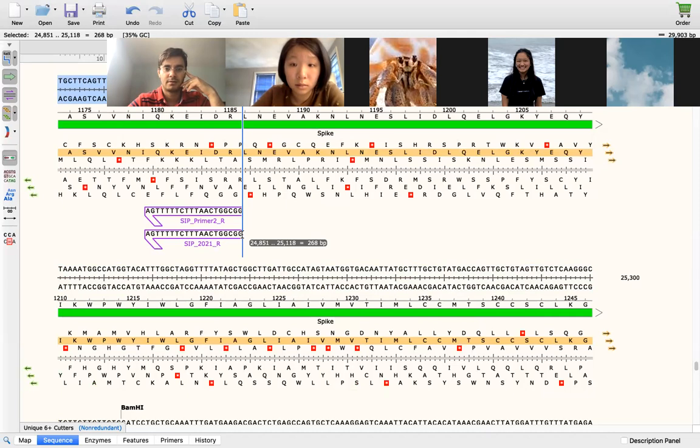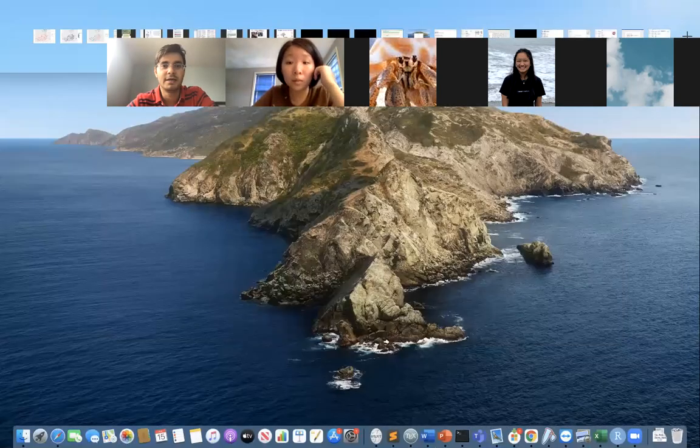Yes, because we set it to be from 200 to 300. Right, exactly. But this number has to be exactly the same as the one on the website. Do you agree? Because if it is not, there is something wrong, of course. 268.